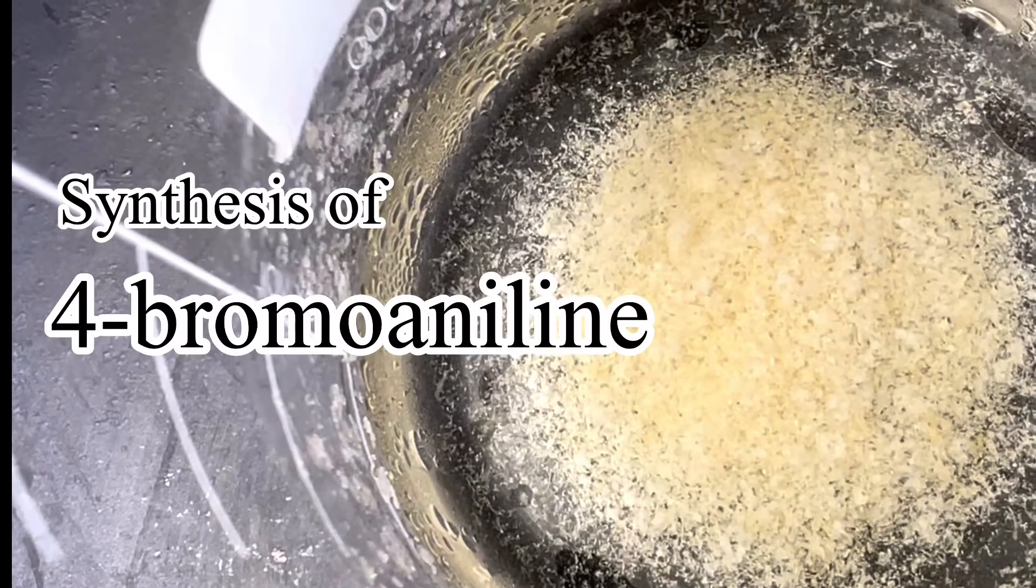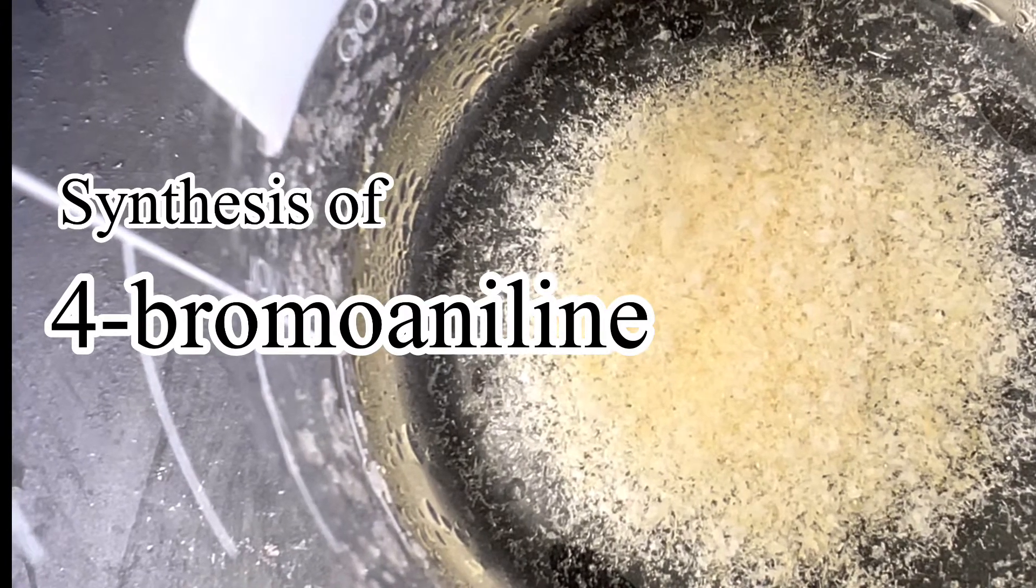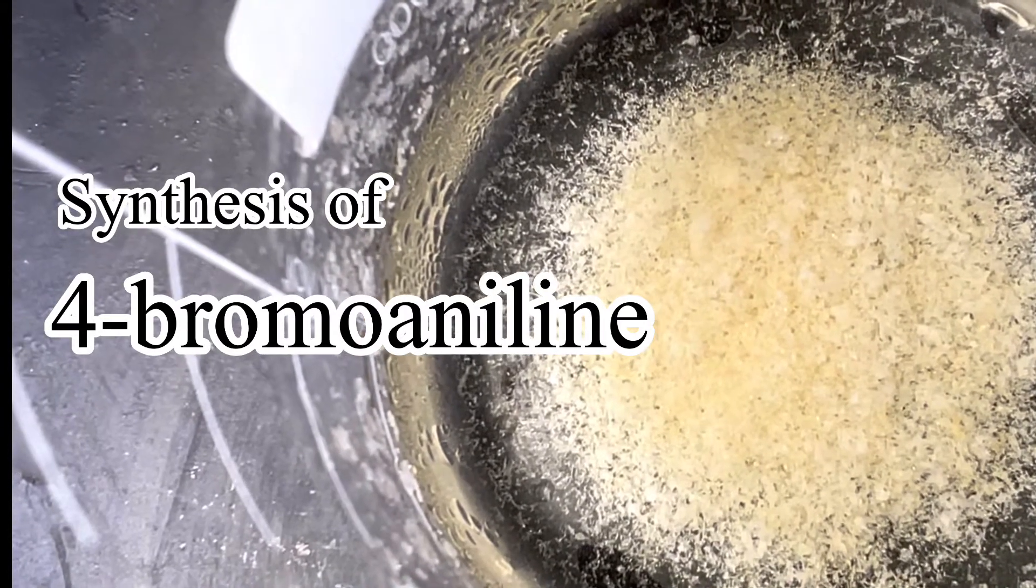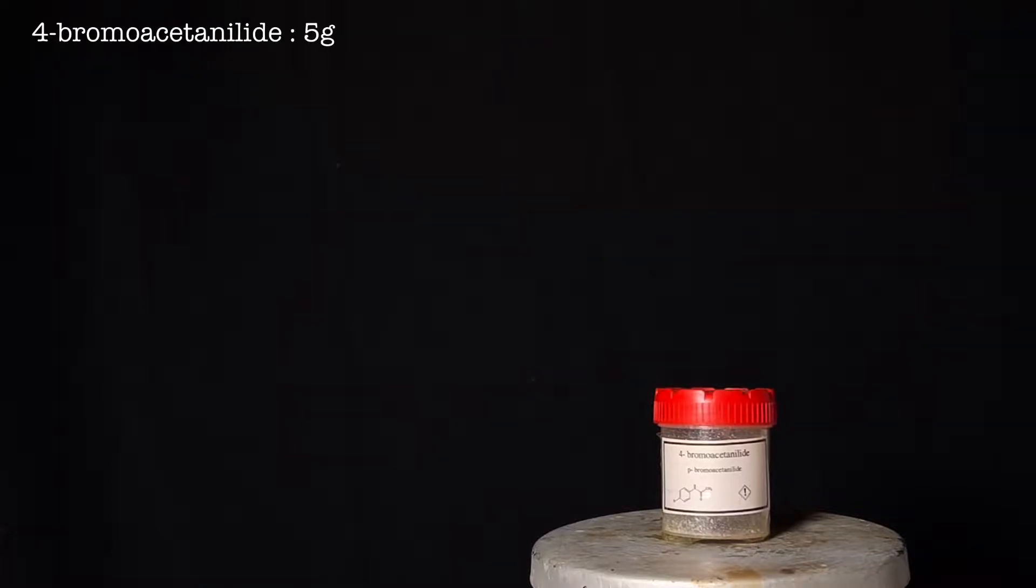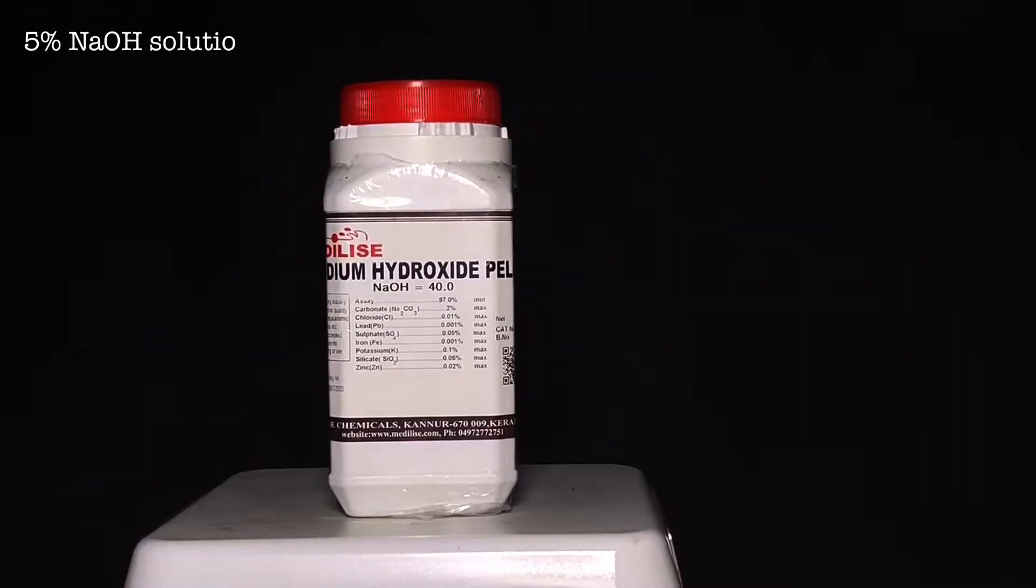Hello friends, in this video we will synthesize parabromoaniline from parabromoacetanilide by acidic hydrolysis. For this synthesis we will need 5 grams of parabromoacetanilide, 5 milliliters of 37 percent hydrochloric acid, and 200 milliliters of 5 percent sodium hydroxide solution.